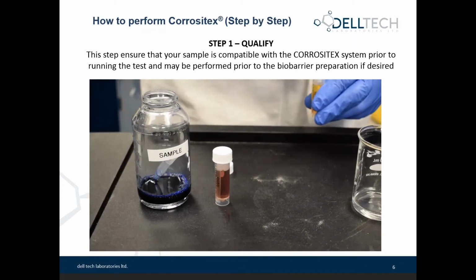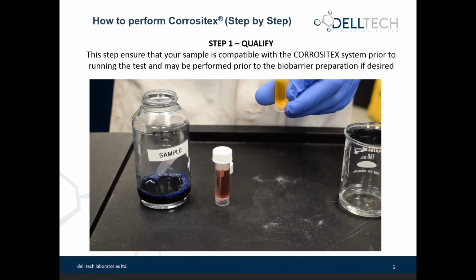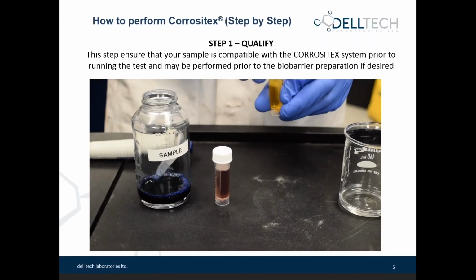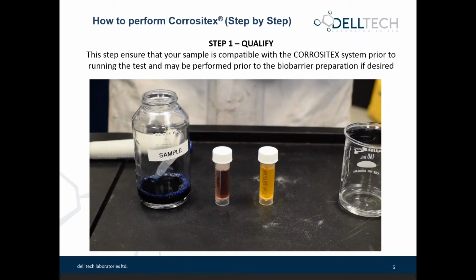In the second example, we'll see there's no color change, and that's a negative response, and the sample is not appropriate for Corrositex. What we would do is recommend that you contact your technical representative at Vitro International for guidance on what to do at that step.